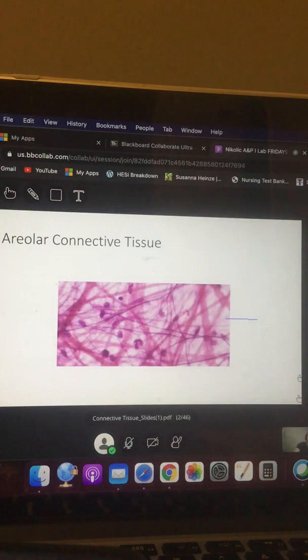Awesome. Okay, are we ready? The questions I can ask you are on page 40, number 7, connective tissue. This is called areolar connective tissue. It's very obvious. There is no mistake in this for anything else. Okay, guys, are you ready? Let's do this. What is this? Go. Don't tell me nucleus. I will cry. Fibroblast.